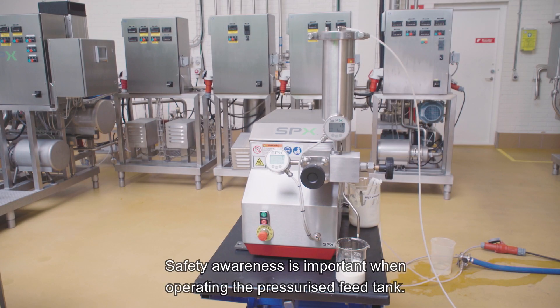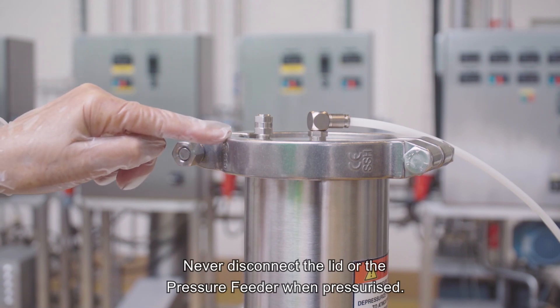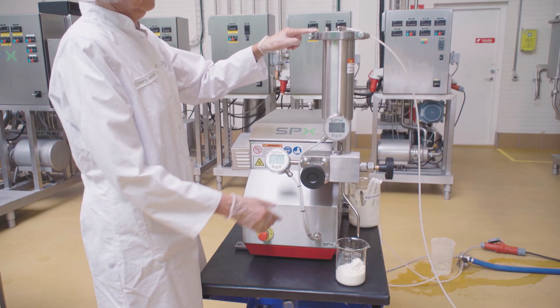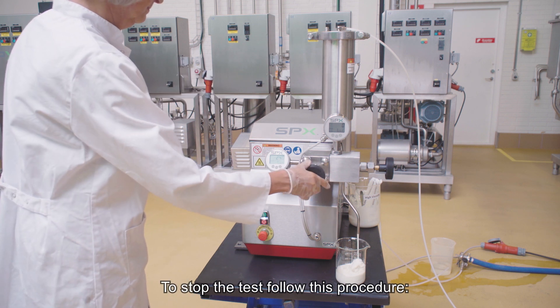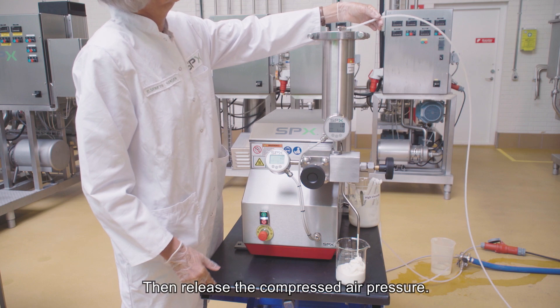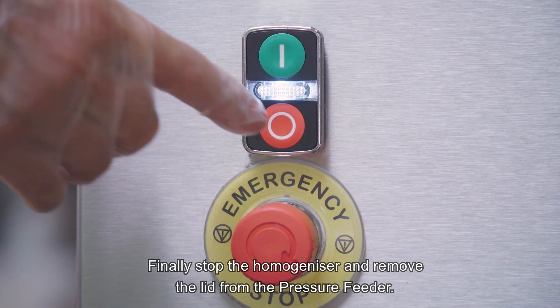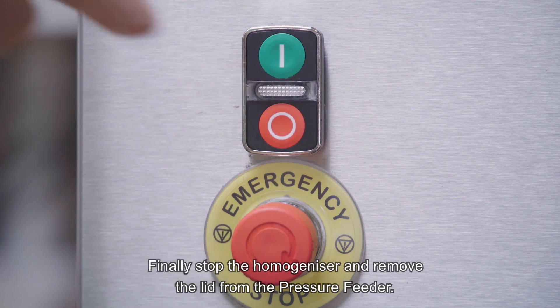Safety awareness is important when operating the pressurized feed tank. Never disconnect the lid or the pressure feeder when pressurized. To stop the test, follow this procedure: release the homogenizer pressure, then release the compressed air pressure, and finally stop the homogenizer and remove the lid from the pressure feeder.